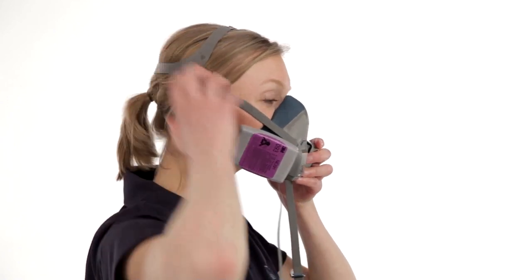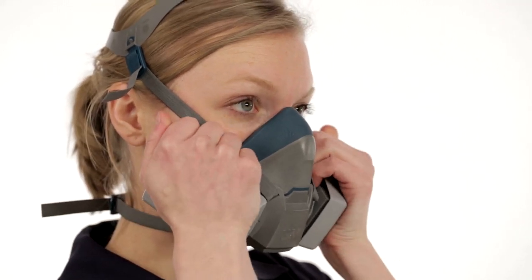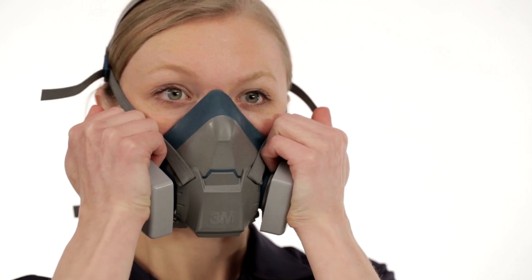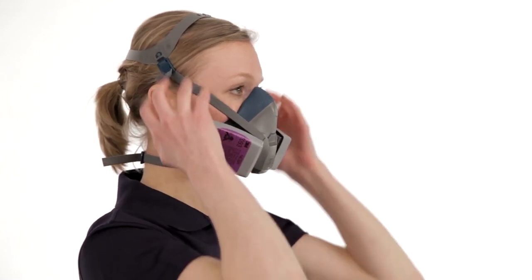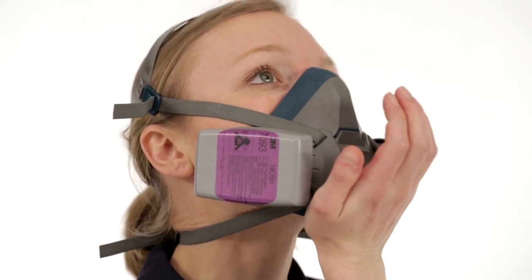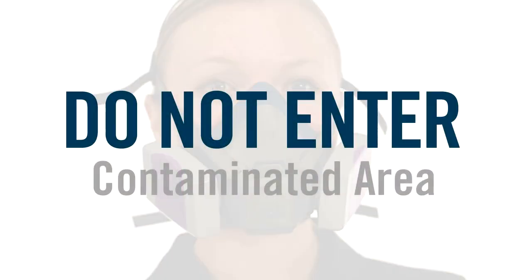To perform a negative pressure user seal check with rectangular 7000 series particulate filters, squeeze to compress the filter. After sealing the filter or cartridge inlet, inhale gently. If the facepiece collapses slightly and you feel no air leaking between your face and the face seal, your respirator has sealed properly. If you detect air leakage, reposition the respirator on your face or readjust the tension of the straps, then repeat the seal checks. If you have difficulty getting the respirator to fit, review the user instructions. If it still doesn't fit correctly, see your supervisor. A user seal check must be performed every time you put on your respirator. Never enter a contaminated area if your respirator does not seal properly.